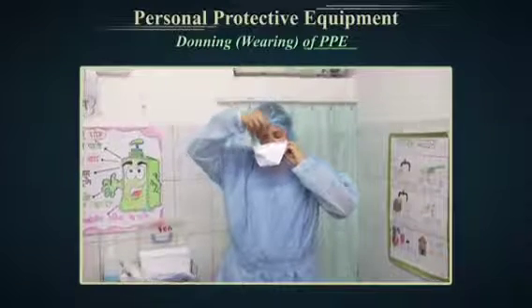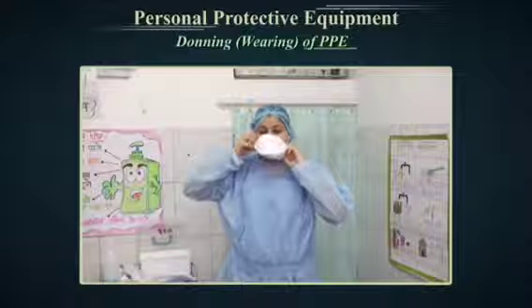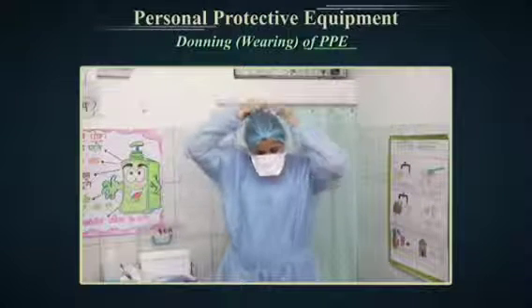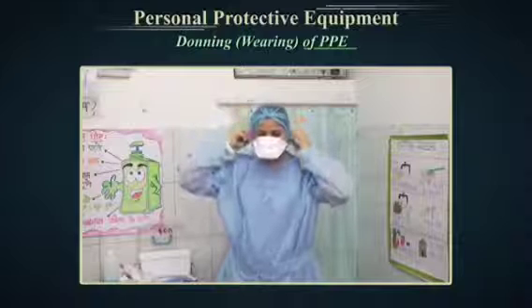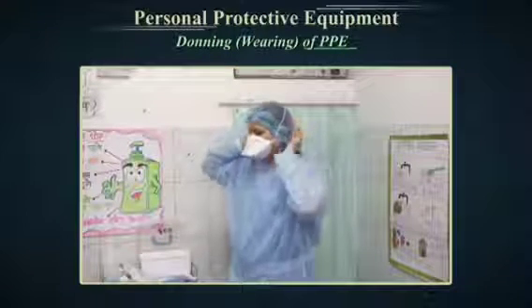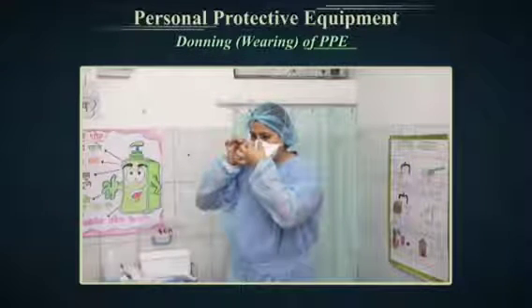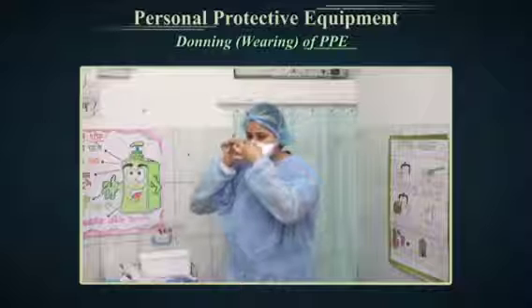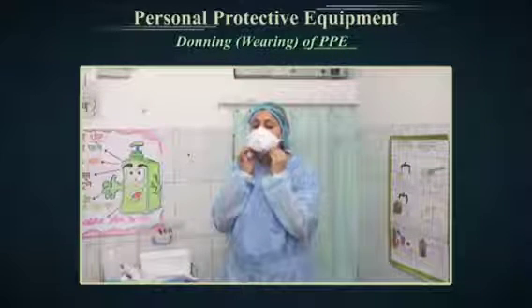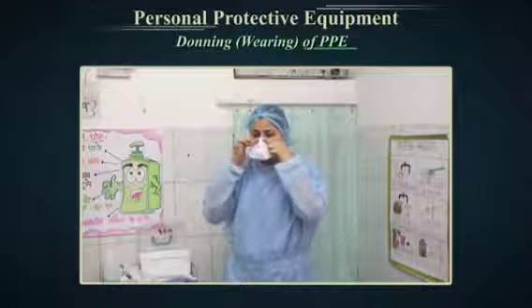Place a respirator over your nose, pull the strap and position one across your head and the other across the base of the neck. These elastic straps should be in touch with the skin of the head and remove any hair in the way. Press the mask along the edges to seal it with the skin. Finally, breathe deeply to feel any area where air is escaping out along the edges.